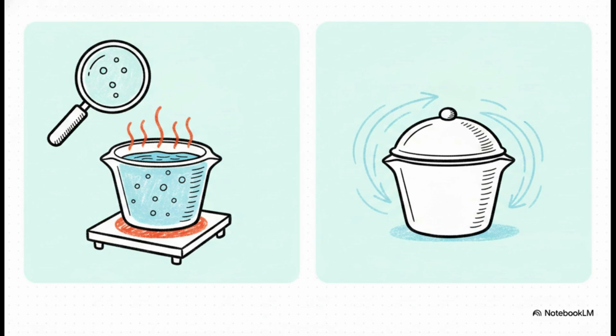During the heating phase, we have to heat the crucible super slowly on a hot plate. Why? To avoid splattering. If even a tiny droplet of our compound splatters out, our final mass is ruined and the whole mathematical formula is corrupted. We also have to take it off the heat immediately once dry so it doesn't melt. On the flip side, during the cooling phase, we must cover the crucible and let it sit until it hits room temperature. It's two entirely different types of thermodynamic control, and they're both absolutely vital for accurate data.